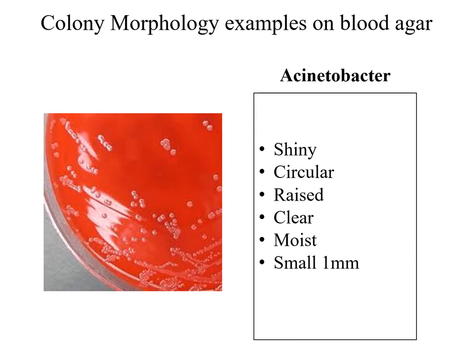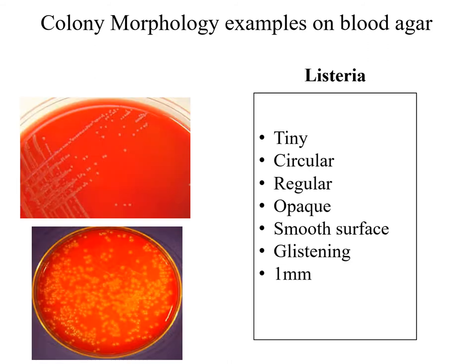Another example is Acinetobacter. As we can see here, the colonies are shiny, circular, raised, clear, and moist. They are small in size, around 1 mm in diameter.